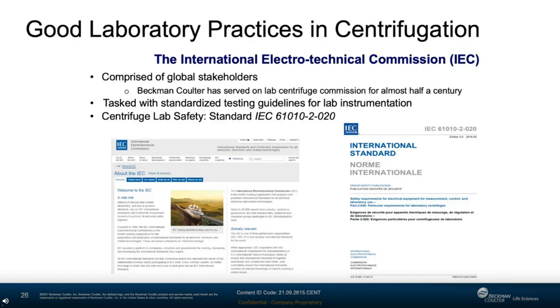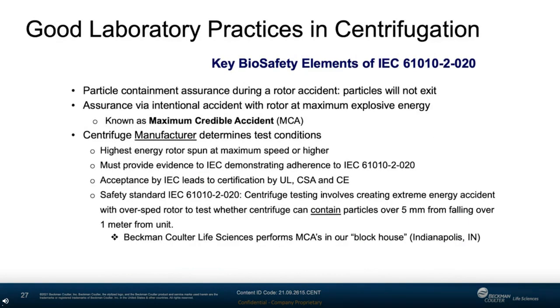I might also add they are literally tested and exploded in a blockhouse. And this is per IEC guidelines. The Centrifuge Lab Safety Guideline, and here it is, IEC 61010-2-020, calls for the testing of the ability of a new centrifuge to contain a severe rotor accident, which it terms a maximum credible accident.